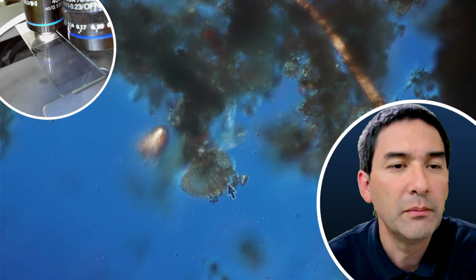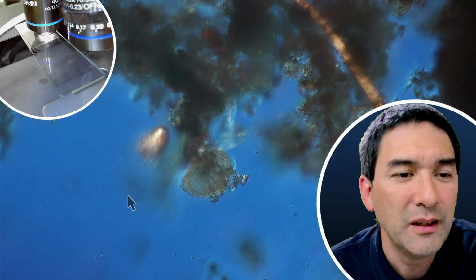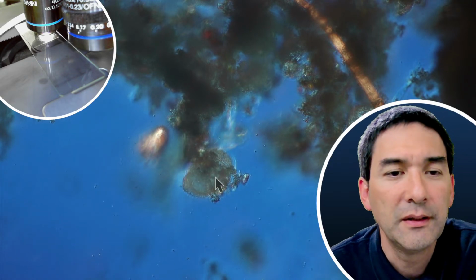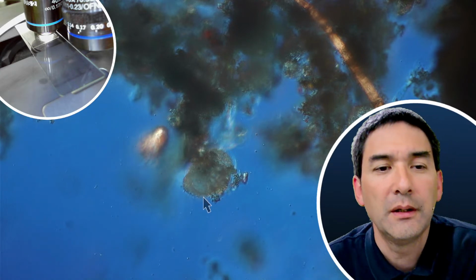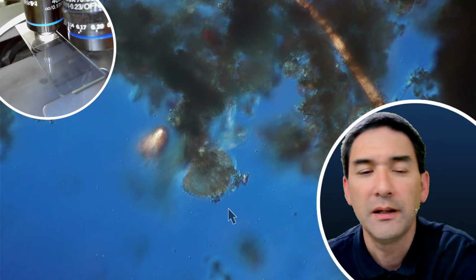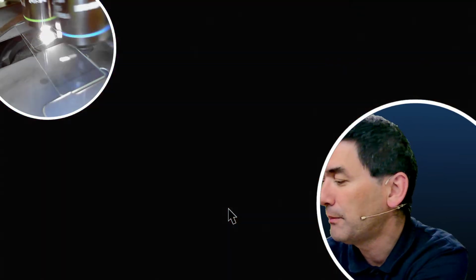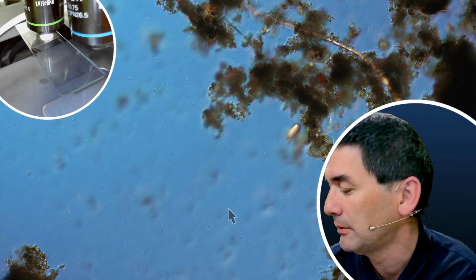Look, there are some moving organisms as well. Okay, you've seen this here. But this here is most likely pollen of a plant. I don't know which one, obviously, but it's nothing unusual to be found here. Of course, there are many plants there in the area as well. For getting a better overview, let's start to go down with the magnification again a little bit here.